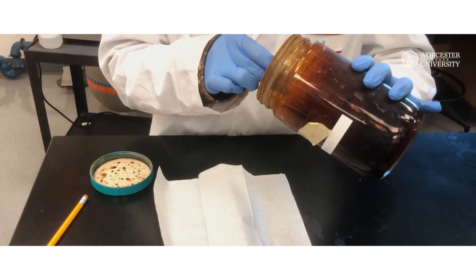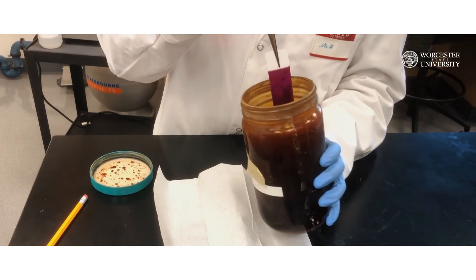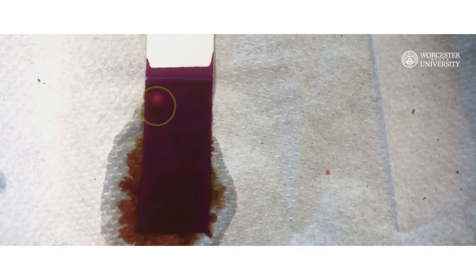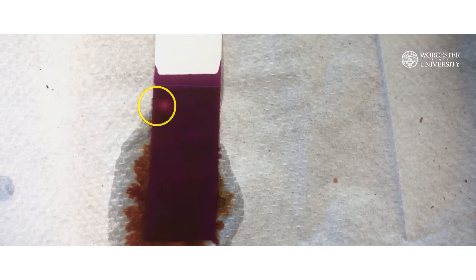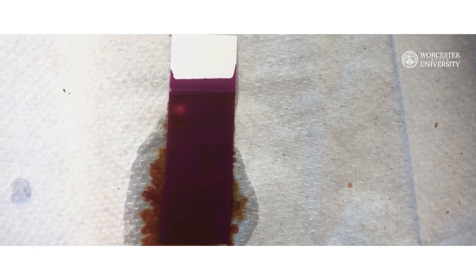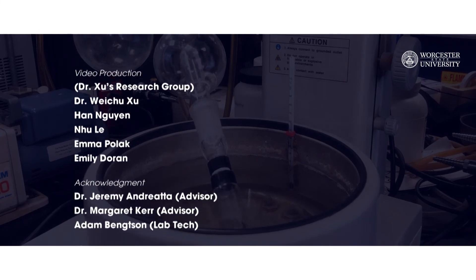Finally, dip the developed plate in the KMnO₄ solution provided. Permanganate will oxidize any stilbene on the plate, as evidenced by a yellow spot on the plate. This will help to determine if any of the starting materials remain in your product. Don't forget to also take an IR and an NMR of your product.